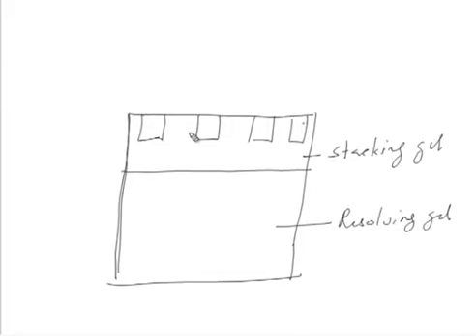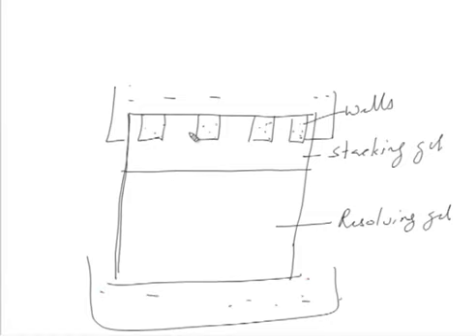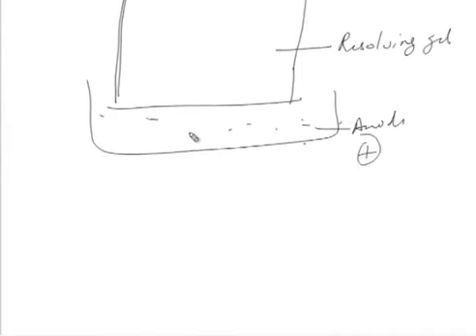These are wells where the sample is loaded. So, your sample will be loaded in these wells as per how many samples you have, and on top and bottom there will be electrode buffer. This is the cathode chamber and this is the anode chamber. All right. So, this is how the whole thing is here. You can see the sample is between the stacking gel and the electrode buffer here. All right. So, let us move on.